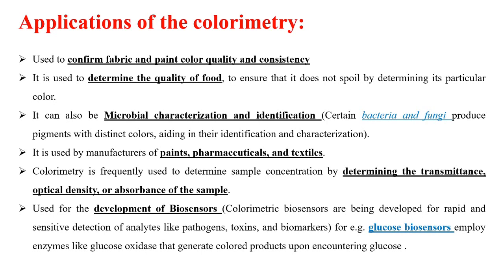If you go for bacteria and fungi, their pigments are different, so we can easily identify whether this is a fungus or bacteria through their colors.